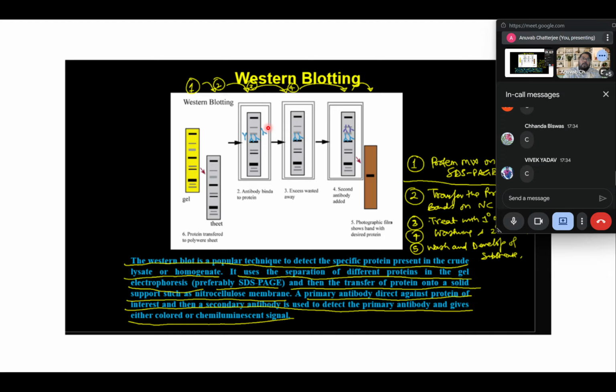So how? If you have an antibody against protein A that in the world only you use, making that antibody along with a radio label tag will be immensely expensive for you. What instead you do is that you make an antibody that is specific to your protein, which is way cheaper, and you make a secondary antibody that binds to your primary antibody.